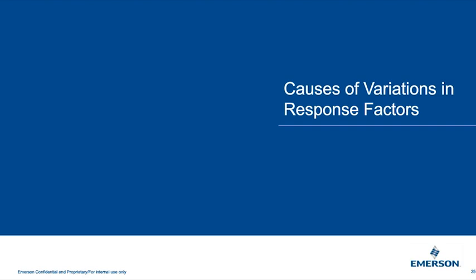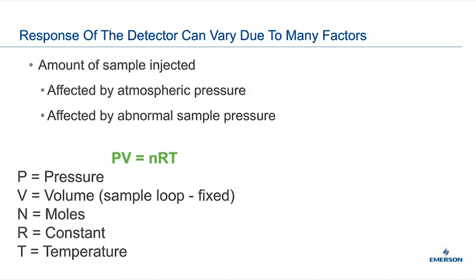We'll answer that in private. I'm going on to the next section, where we had a question: how does pressure affect your response factors? It does. We'll hear more at the end, but there are a couple of things on our hit parade. Response factors is one of them, and unnormalized total also relates to pressure.